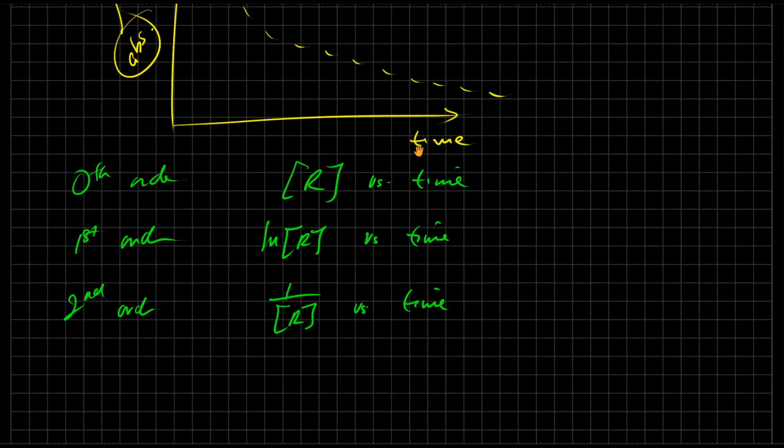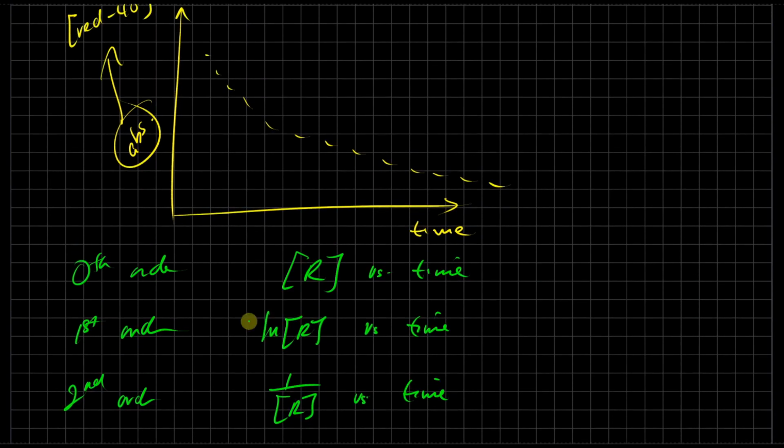Now, since we don't really have the concentration versus time, we have absorbance versus time, we're instead going to plot absorbance, natural log of absorbance, and 1 over absorbance, but the information that it gives us will be exactly the same.